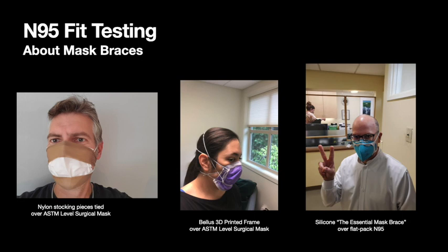So here are 3 examples of mask braces. On the left is a simple nylon stocking cut and tied in such a way to essentially seal the nose area and the chin area. In the middle is what's called a Bellis frame. It's a custom scan 3D printed frame. It's actually pretty easy to make, and I'll put more information about these in the video notes. It creates a very good seal. I'd say the only drawbacks we've heard is that comfort can be an issue for long-term wear, and it can be brittle. The 3D printing filament that's used can sometimes break after a few wearings.